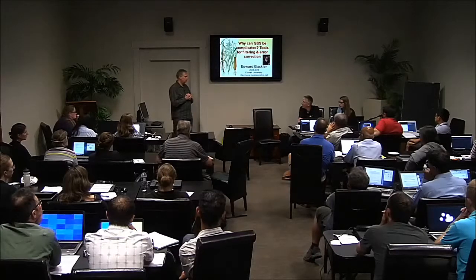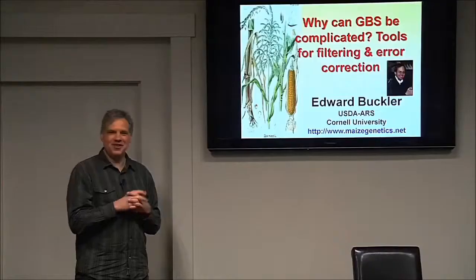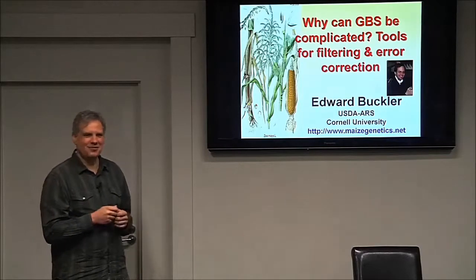Which is why they're now treating each alignment as simply a hypothesis, to be physically tested. The alignment of a tag is a hypothesis, but if we lift that 64 base limit, it's going to be a much better hypothesis, so that's a really good reason.